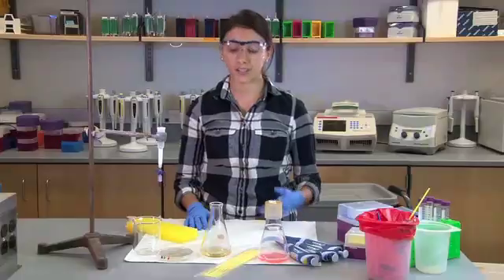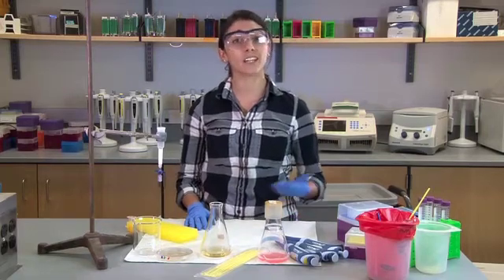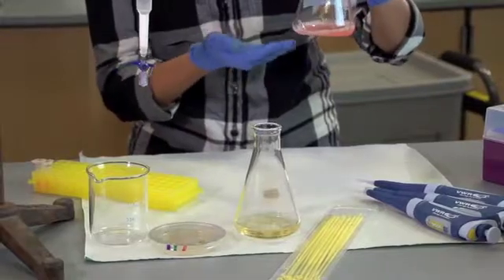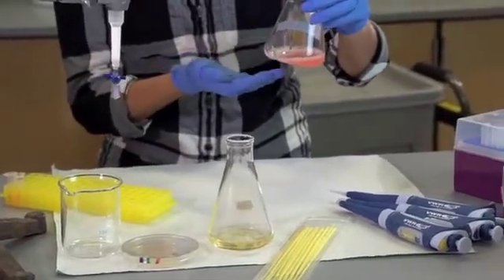Once you have your culture ready, it's going to grow overnight, so the next day you will most likely come back to your class and have a flask with RFP expressing E. coli.